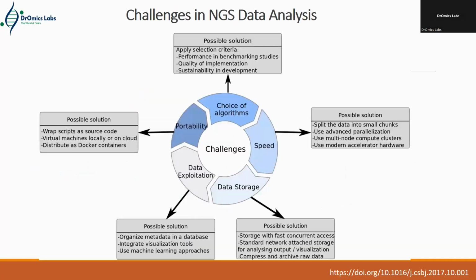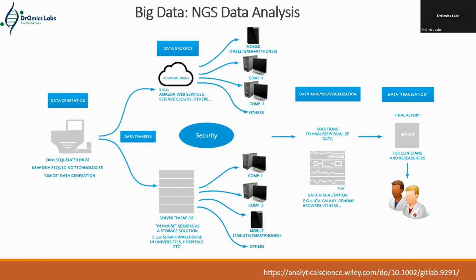And then comes the visualization part. Earlier we used to think that only a laptop or computer is used to visualize the data, but now you can use smartphones and tablets to visualize and go through the results very quickly. There are a lot of tools, but it's still a very naive field. So if you want to develop applications for tablets and smartphones, there is ample opportunity still existing in the market. You can think about that also.